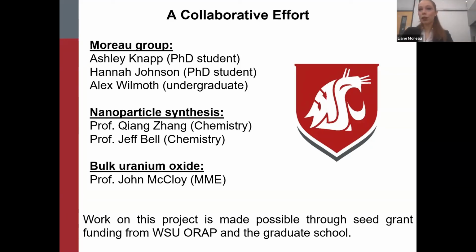Well, thank you. That's a really good point in considering the uranyl peroxide clusters. That is something that we've thought about in the context of at least the systems that will have some water interface, because that would be relevant to these systems. In the case of these that we've made, I think the reason we're mostly looking at the bulk oxides is based on the first question of, in these more extended solids, what are we expecting to have or to make? We have definitely gotten the question before of, do you have clusters or do you have nanoparticles? Clusters being something that has actually a defined elemental composition that we can actually define. In our case, we think we have nanoparticles due to the polydispersity that we're seeing. We're not really seeing a bimodal, trimodal system.